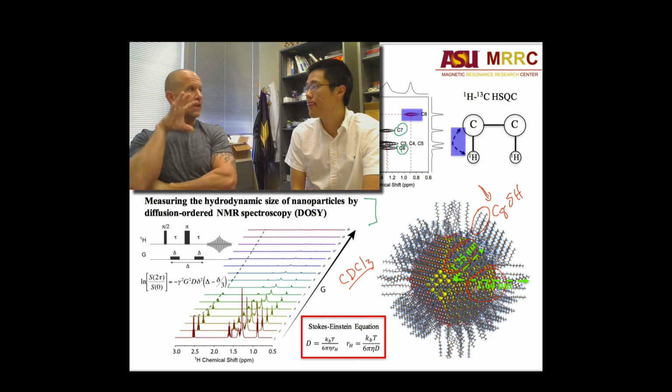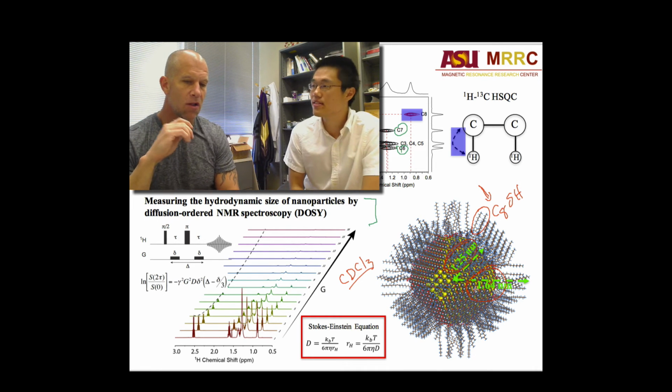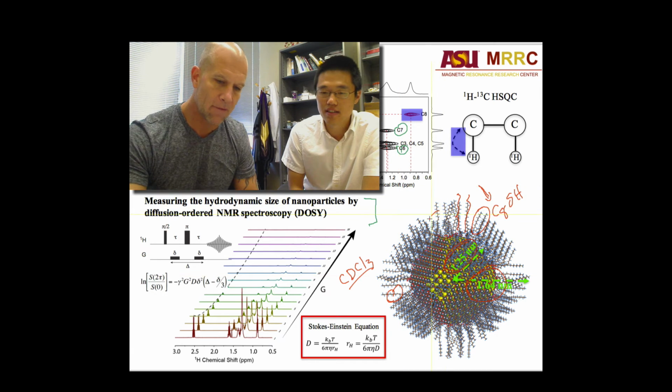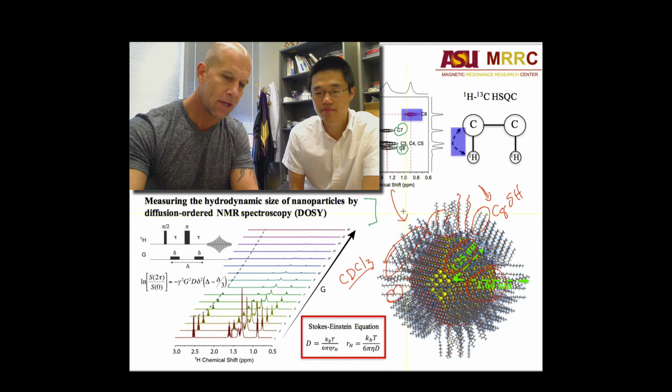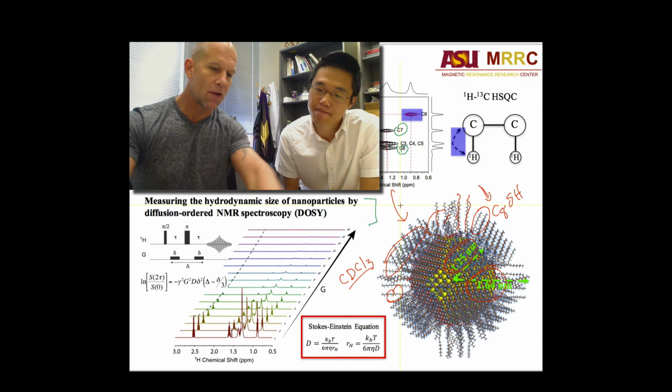Do you actually get an increase in size with the C12? Yes. Is it significant? I would expect it to be pretty small, because you draw these as 100% extended chains, but it's easy to imagine they fold in, since these are all methylene. And since this is hydrophobic and going into a more polar solvent, you would think you'd have quite a lot of control here.